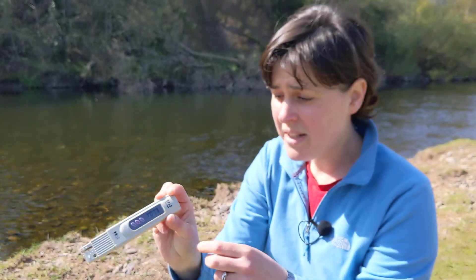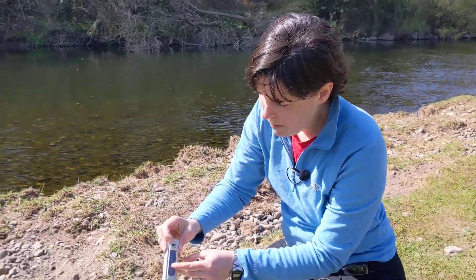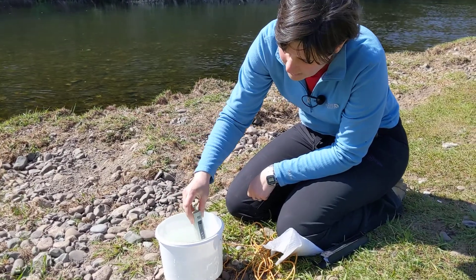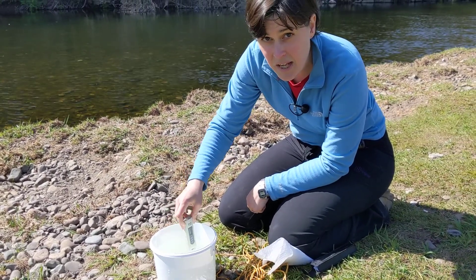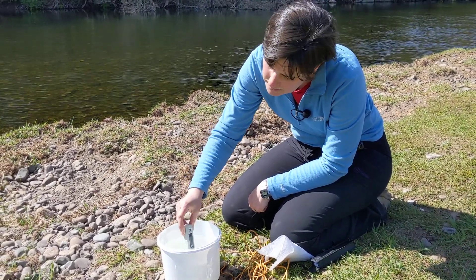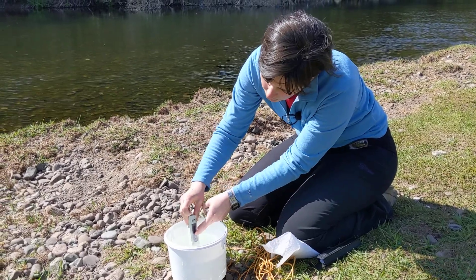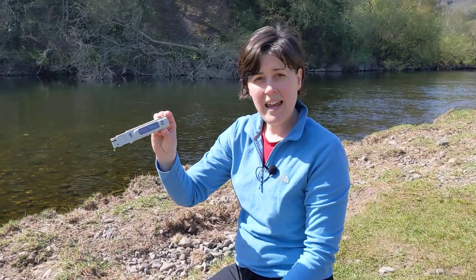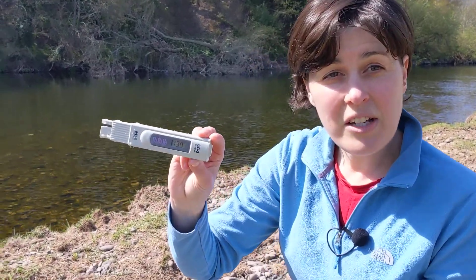The meter can also measure the temperature of the water, so pop it back in and press the temperature button. Give it a few seconds to stabilize, then press the hold button and you can read the temperature — which today is a lovely 13.9 degrees centigrade.